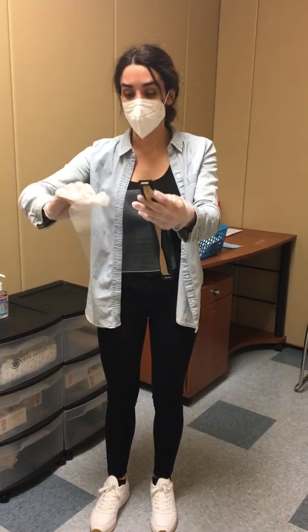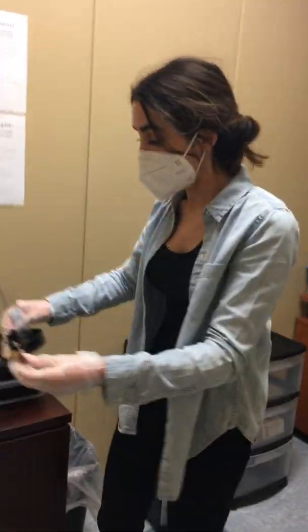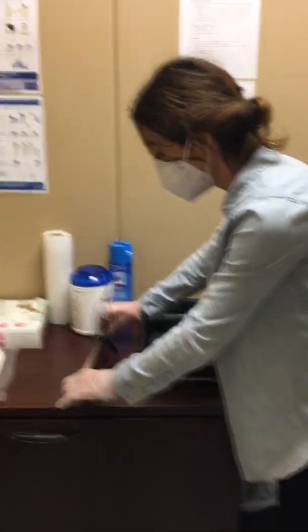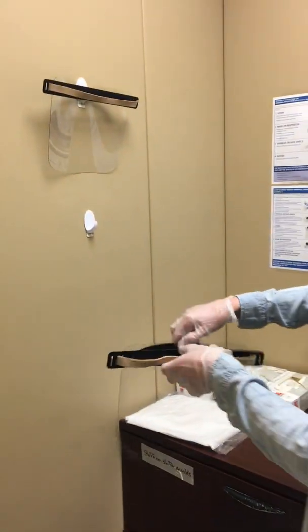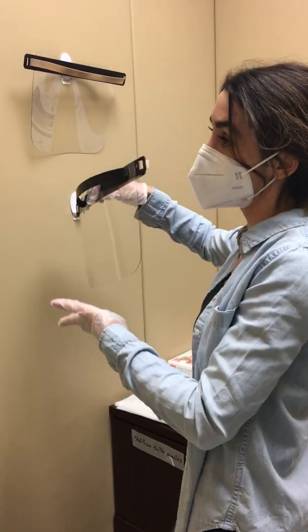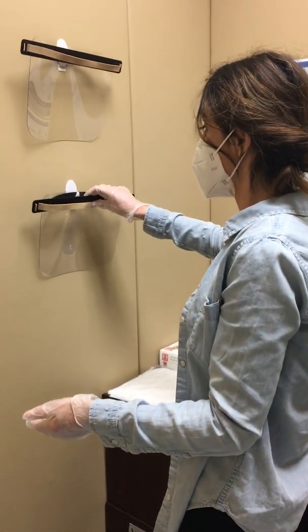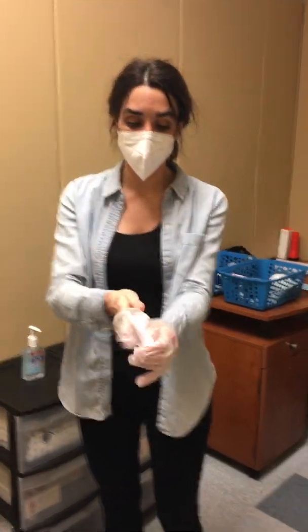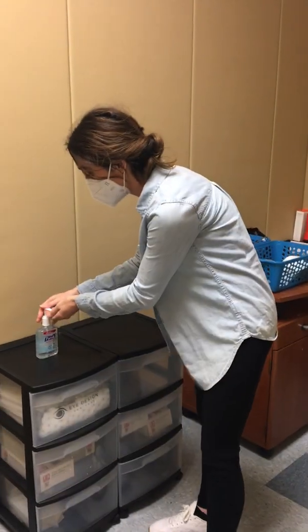And then when I'm storing this, you could either store this like this, leave it there, or you can hang it. And if you hang it, we're going to do it the same way that we did with the gowns, with the dirty part. And again, I did disinfect it. I just mean the part that I had on the outside, I would put against the wall. So then from here, I would again take these gloves off, and I would hand sanitize.